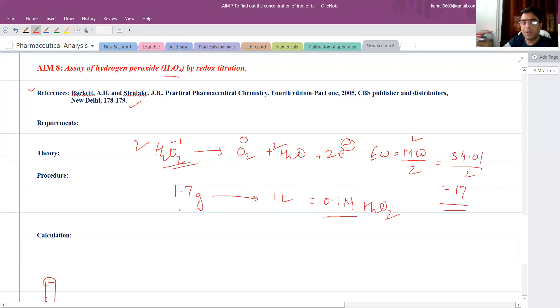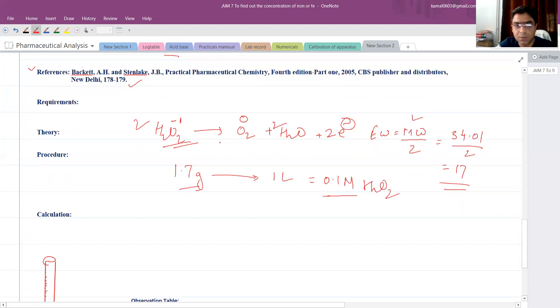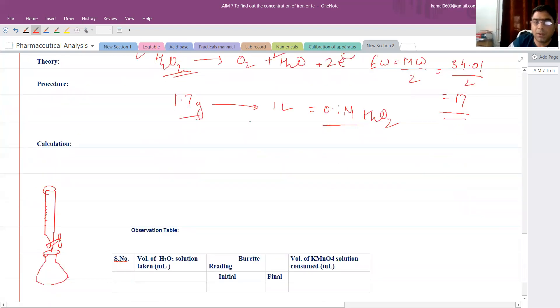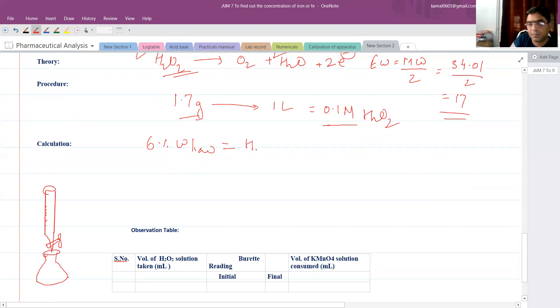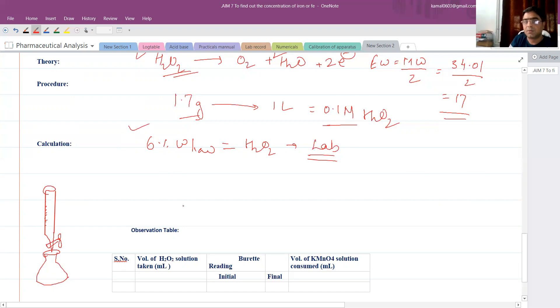Commercially, the bottle of H2O2 available in our lab is 6% w/w. This means 6 grams of H2O2 is present per 100 grams of solution. Our objective is to estimate whether it is actually 6% or not.